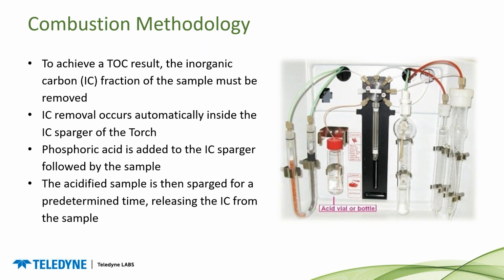The acidified sample in the IC sparger is then sparged for a predetermined time, releasing the IC from the sample out a vent out of the back of the instrument.